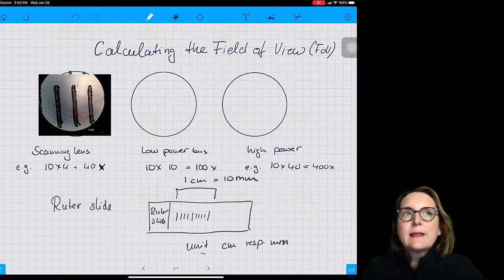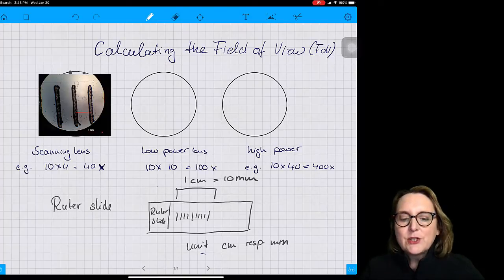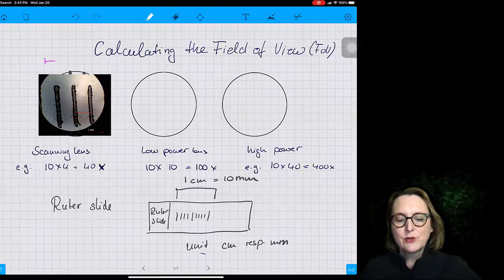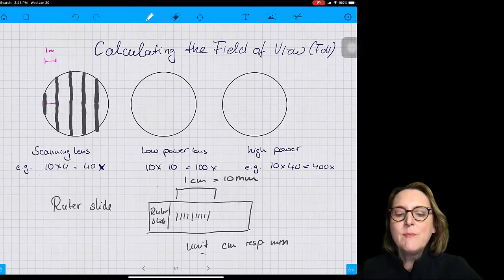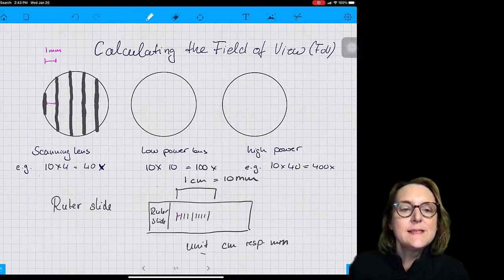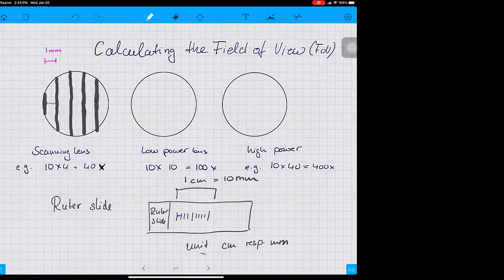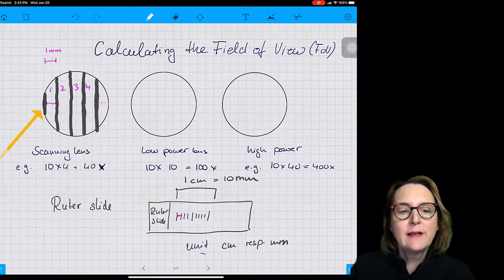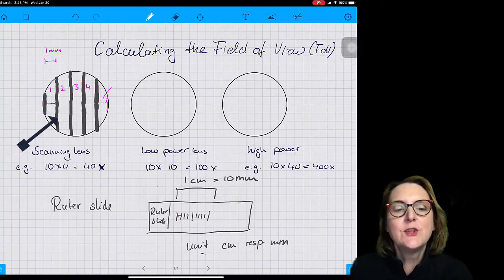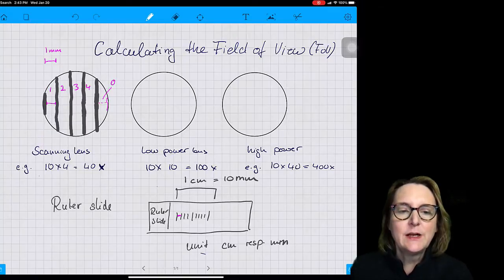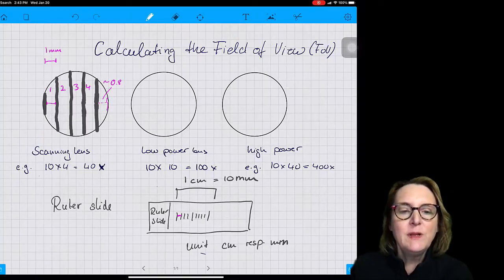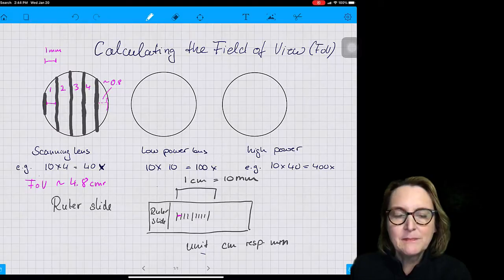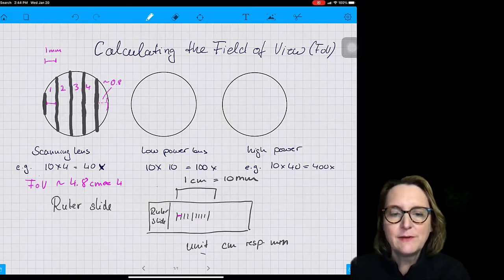In my example, when I measure the ruler slide underneath the microscope — and therefore measure the field of view — I can see that the field of view is about 4.8 millimeters wide. Between the middle of one black line and the middle of the next black line, the distance is one millimeter. So in this case we have a distance of about four millimeters and just a little bit more. With the scanning lens, I can easily measure my field of view.